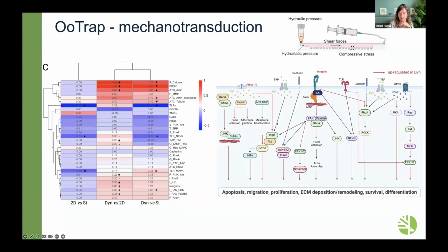And here is a summary. We have higher piezo and piezo pathways, integrin responses as well, for different pathways. So we really have to see that, even though we were not bringing it to the level of the in vivo, we were rescuing a little bit of those mechanotransduction pathways that are missing in the normal in vitro situation.